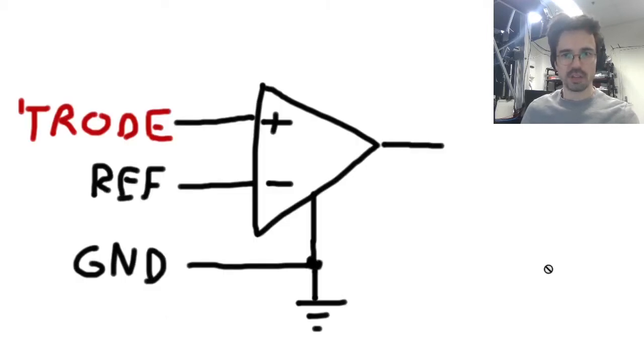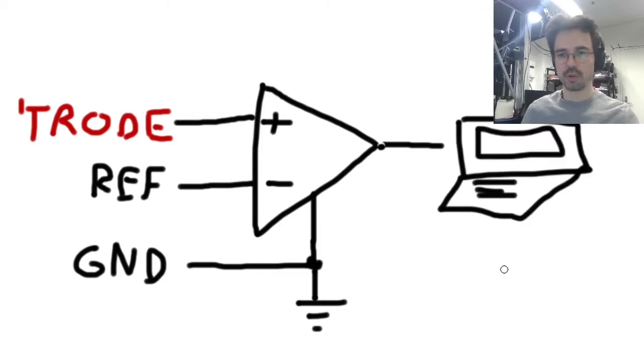At the most basic level, when you think about the amplifier that sits on the head stage, and this is an instrumentation amplifier in the broadest sense of the term, you have a positive and a negative input. And then you have the ground that connects to whatever reference level you're using. So this could be the laptop that you plug into it, really whatever is the ground level.